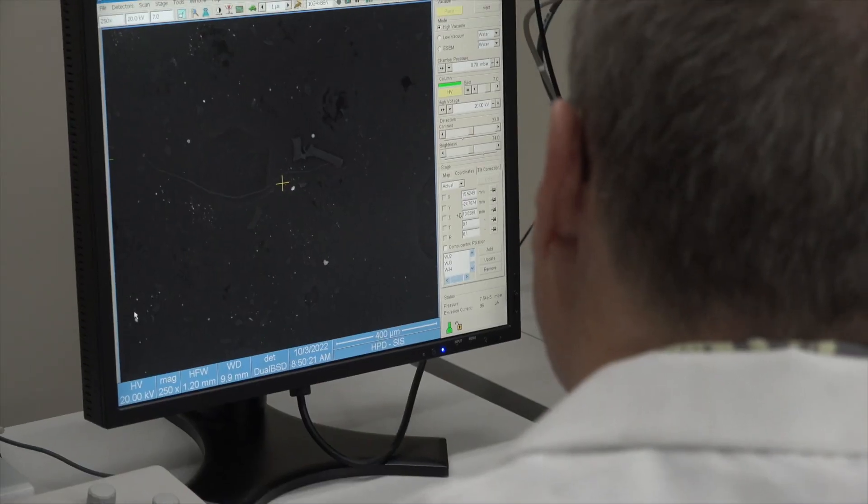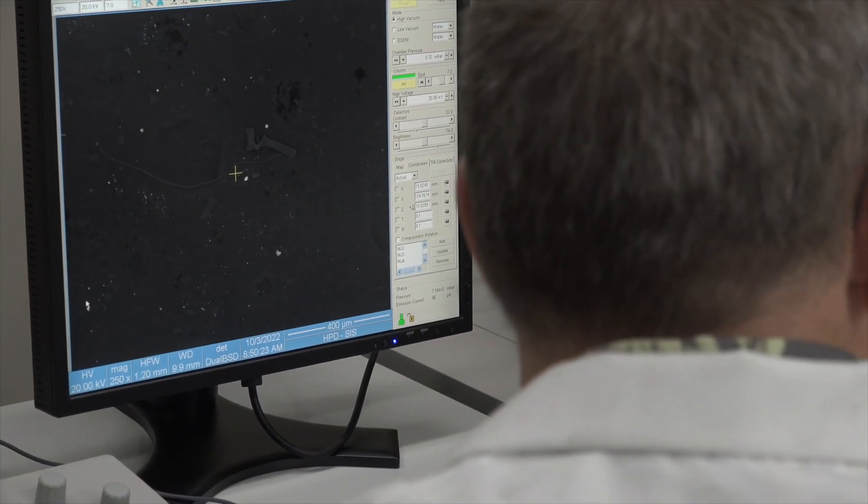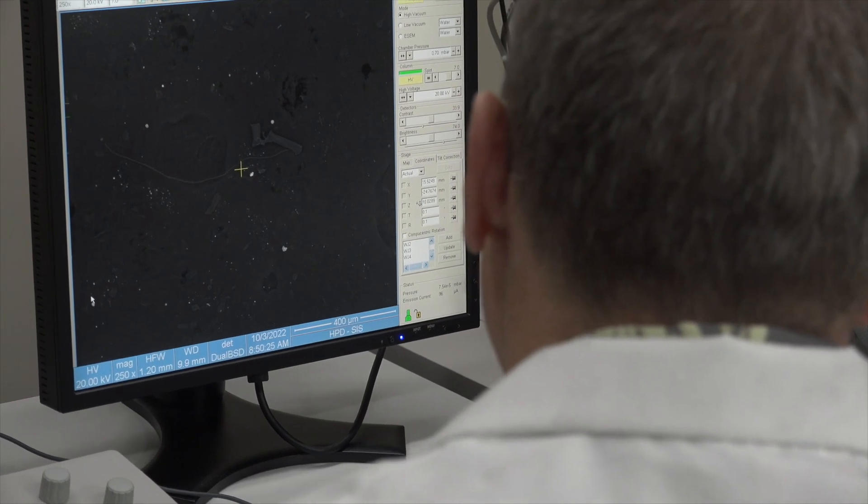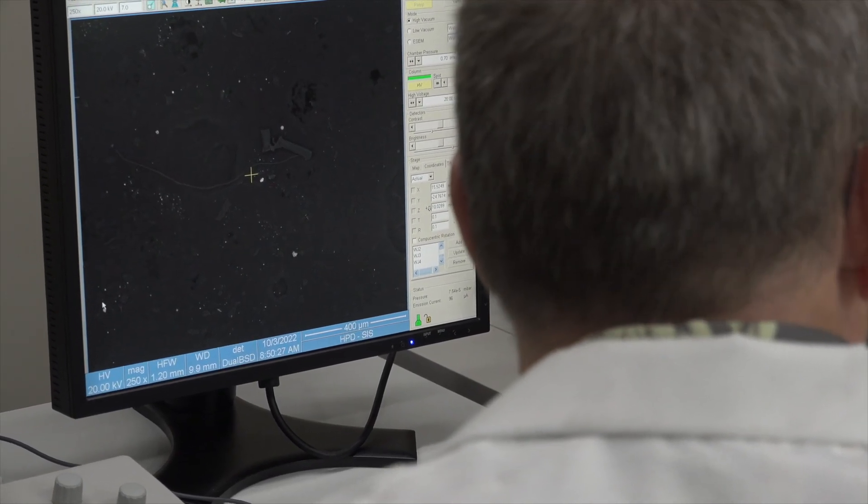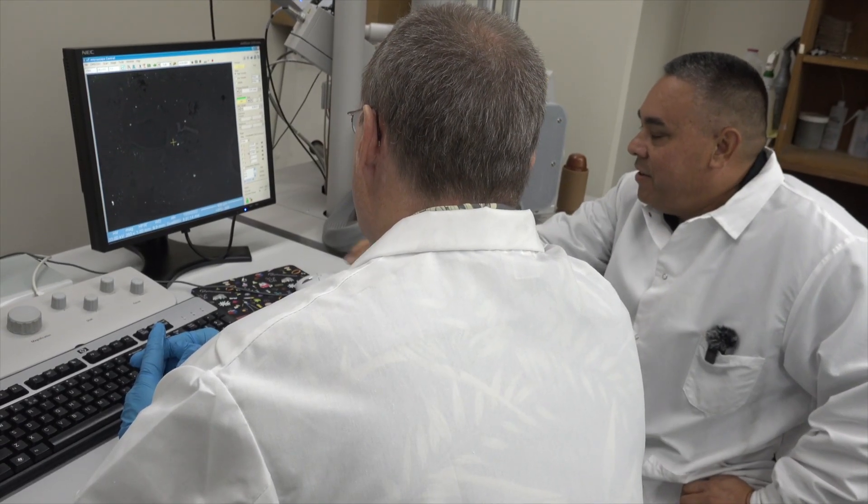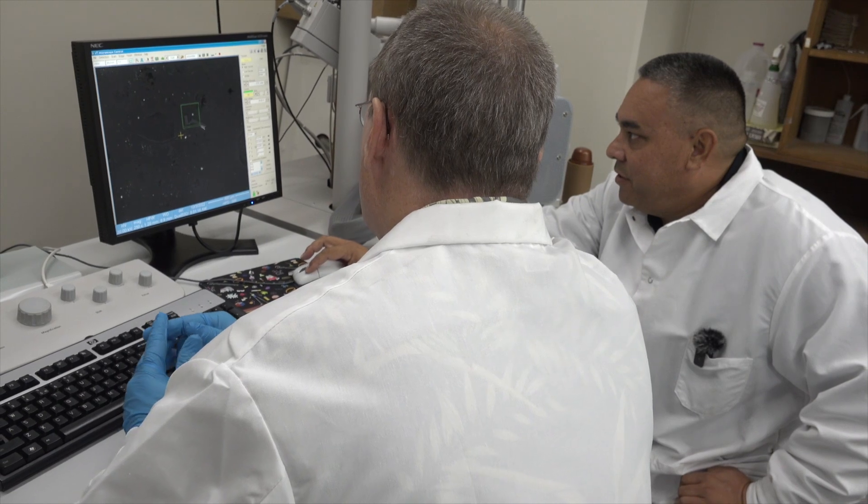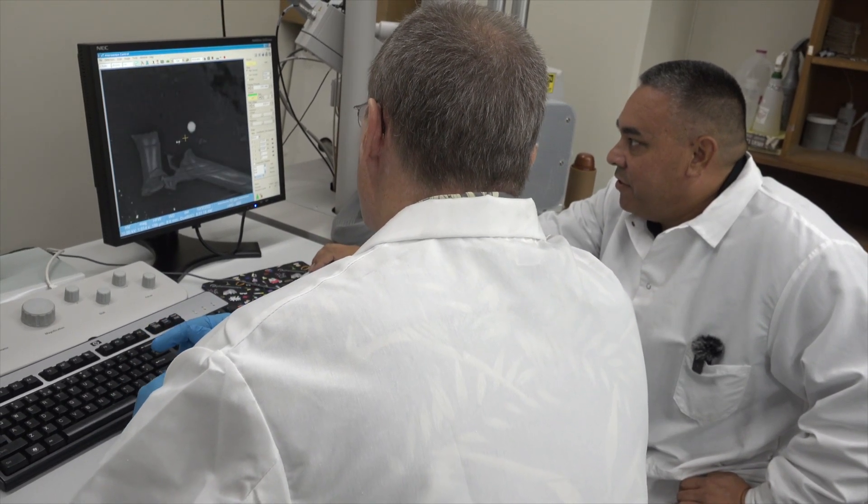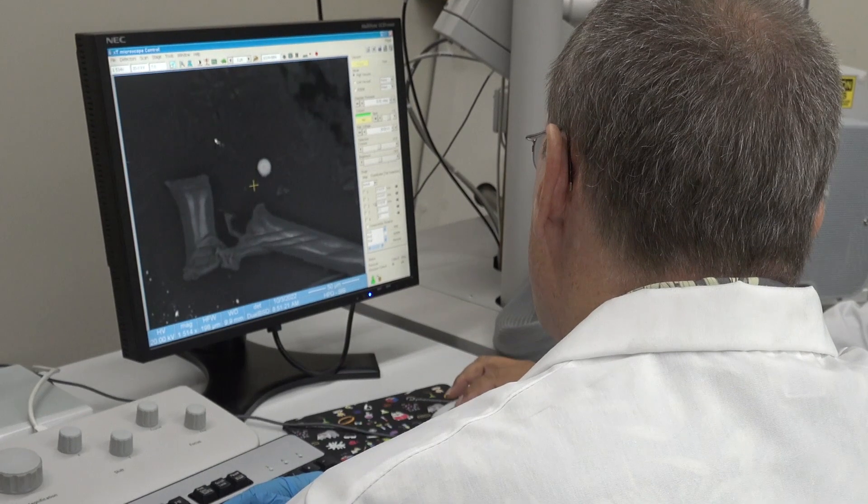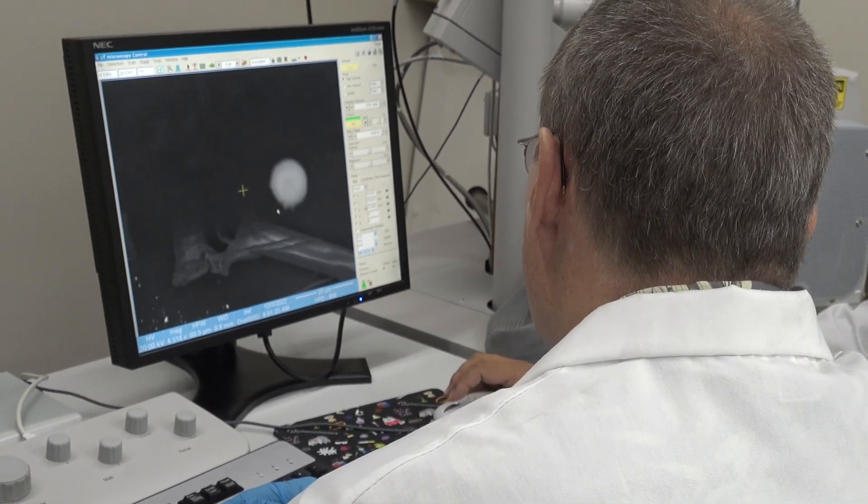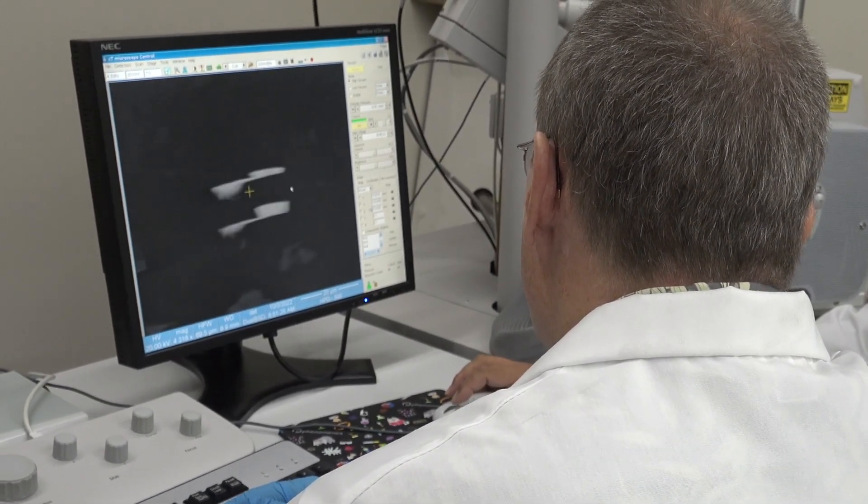So another thing that'll tip us off that something is gunshot residue is the shape of the particle. So the more spherical it is, the more likely to be gunshot residue. So if you see, you see on the screen kind of in the middle, there's a particle here that looks very spherical. There's one that we could consider a gunshot residue particle.